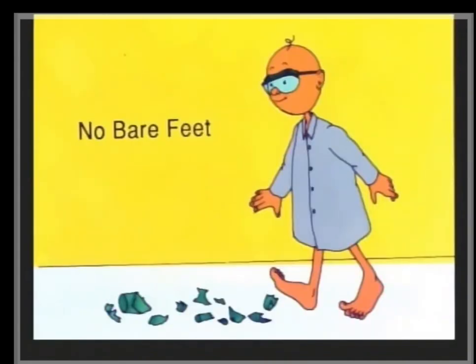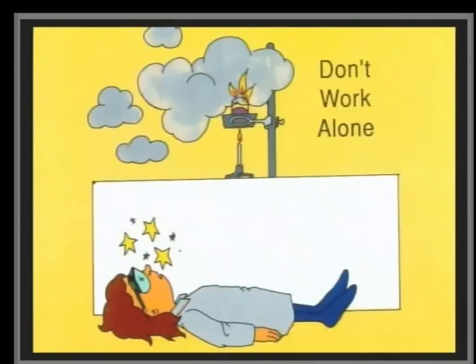You should never enter a chemistry lab barefooted or with open-toed shoes. There is broken glass on the floor most of the time because someone drops at least one test tube or beaker every lab period. If you break anything, please clean it up right away and dispose of broken glass in the proper container labeled specifically for broken glass, not the wastebasket. If you break a thermometer, tell your instructor so the mercury can be disposed of properly. You should contact the instructor for proper cleanup procedure in the event of a chemical spill.